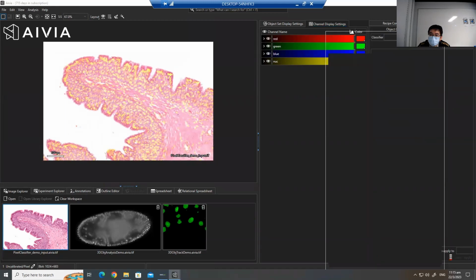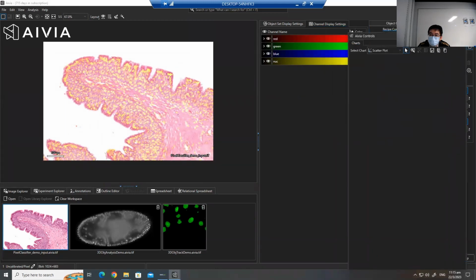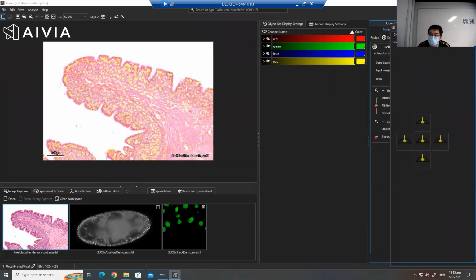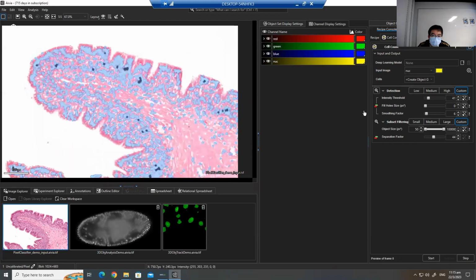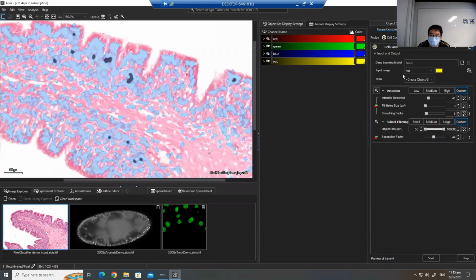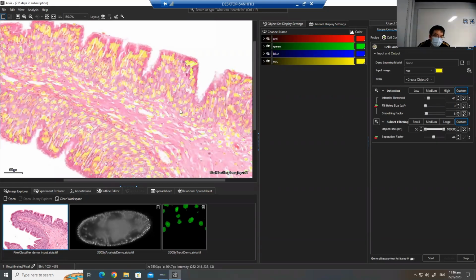Let's see. This again, review. Now we're thresholding with this pixel classification result. Done.